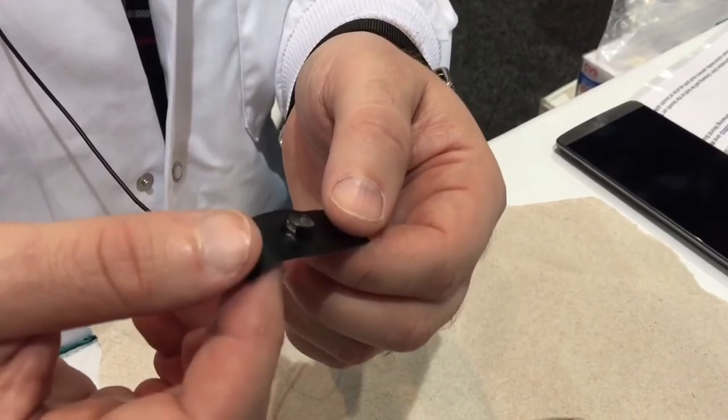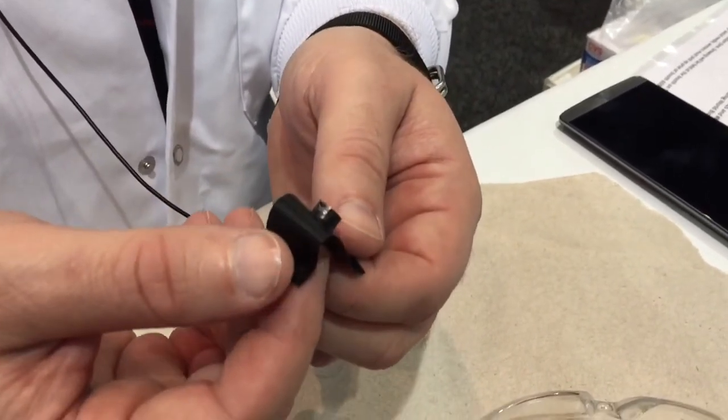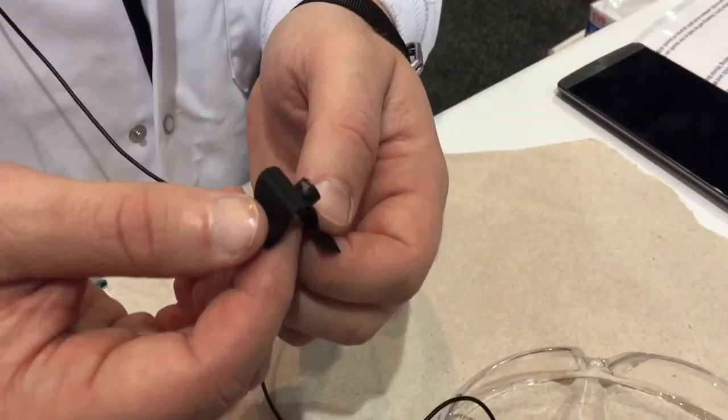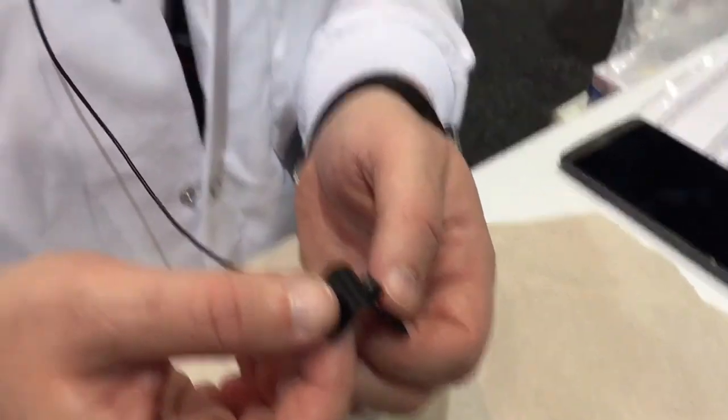So that's a compound lens for a microscope, right? Correct, exactly. What kind of magnification are we going to get? I don't know with these exact lenses, but with some laser pointers we can get up to a 400x magnification.